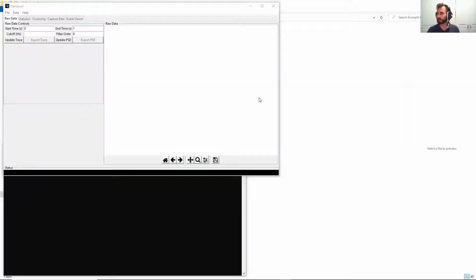And welcome to the first of a series of video tutorials on how to use Nanolyzer to analyze Nanopore data. In this one, I'm simply going to show you how to load a data set and visualize it and get started with the analysis process.